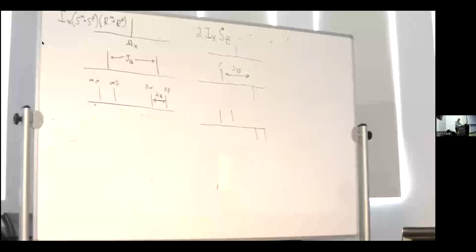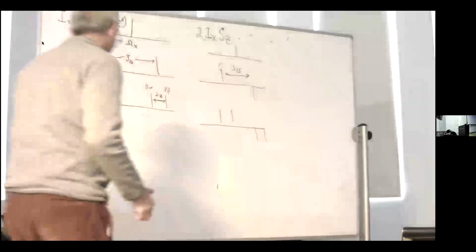You should ignore scalar coupling for 10. Otherwise, you'll be doing it forever and ever. So we have basically a spin echo that's misset a little bit. The 180 isn't perfect, and they never are.